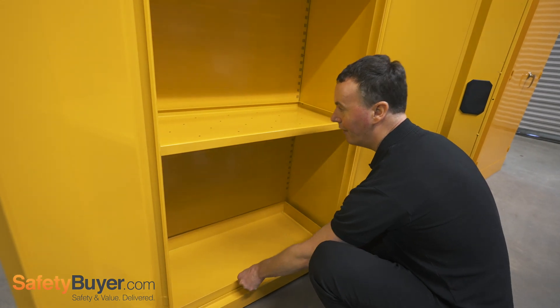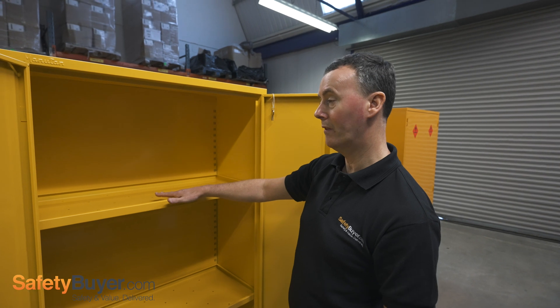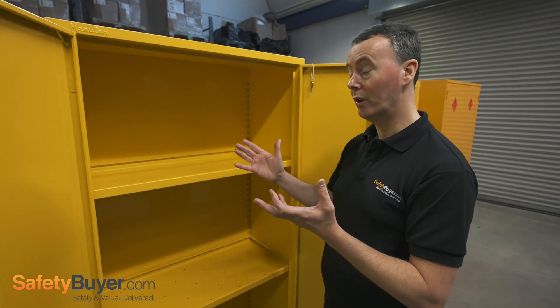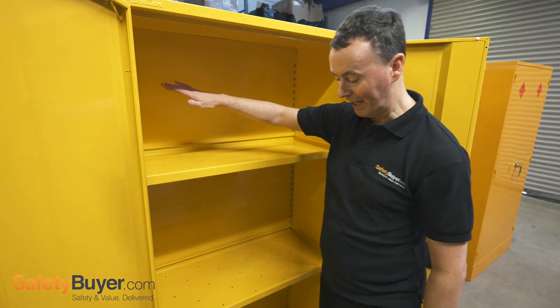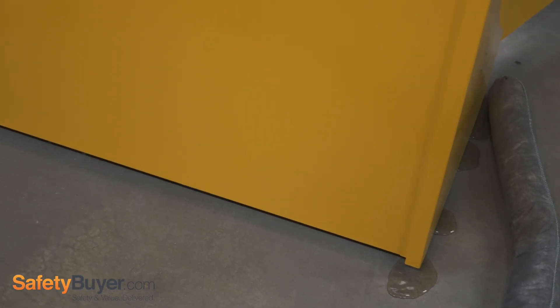And in the event where somebody's perhaps overloaded the capacity of the shelf, or put a container in the cabinet without the lid securely fastened, it is possible that spills can run down the sides or the backs of the cabinet and potentially miss this tray in the bottom of the cabinet.